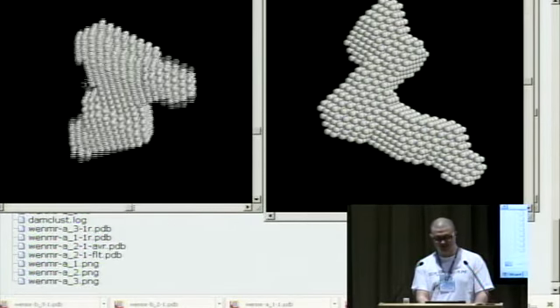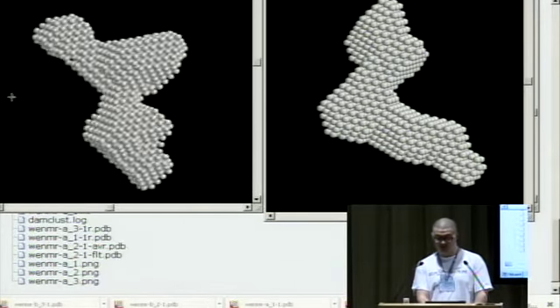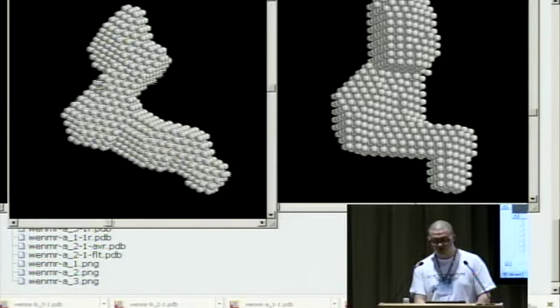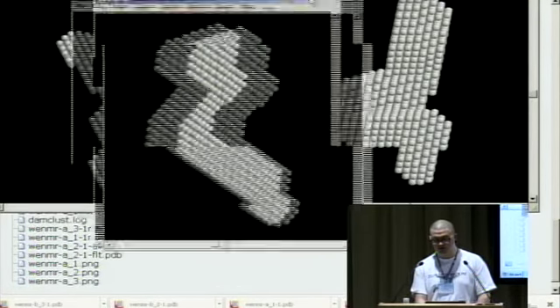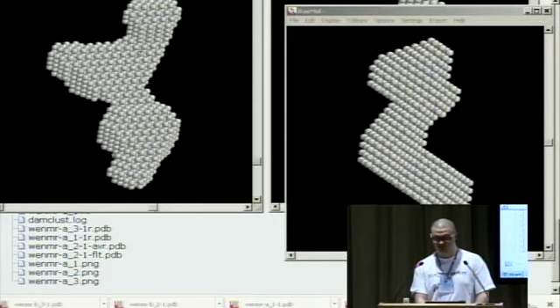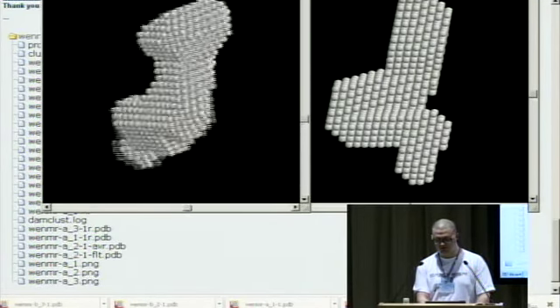However, this one is similar in terms of the overall size and kind of shape, but it's definitely different. So if you would repeat this process many times, you would probably get more shapes that look like this or this, and just a few outliers that would look different. So let's discard this one. I've actually done it, and I know that the resulting shape looks more or less like this.